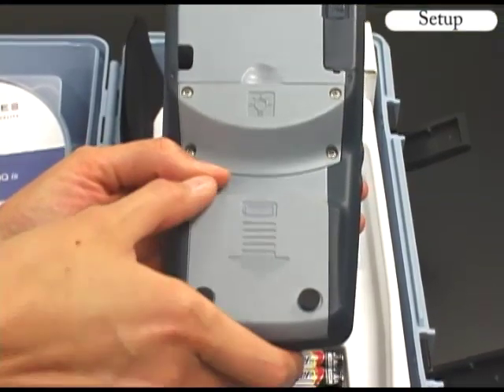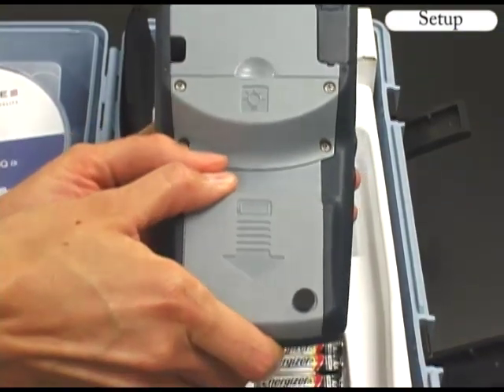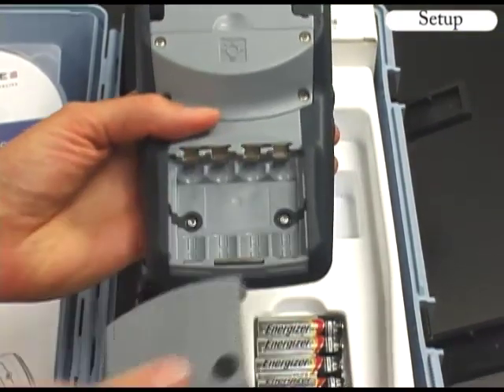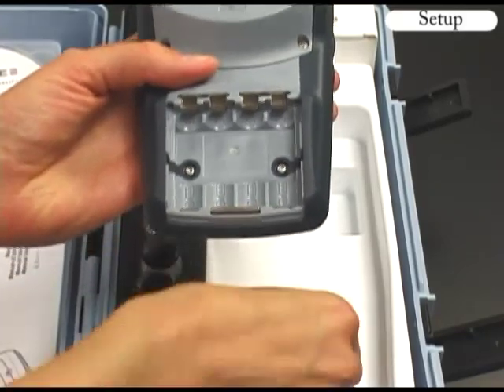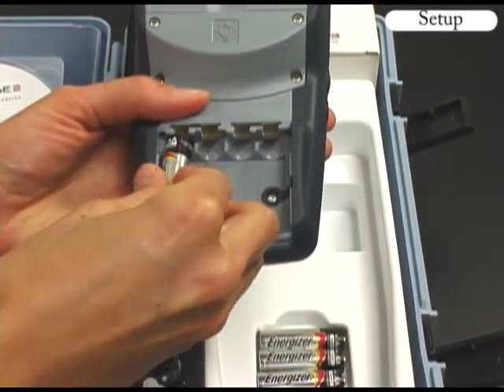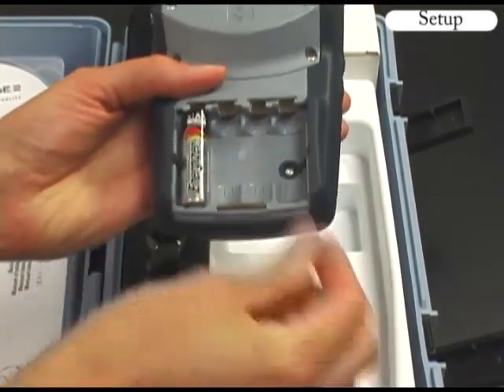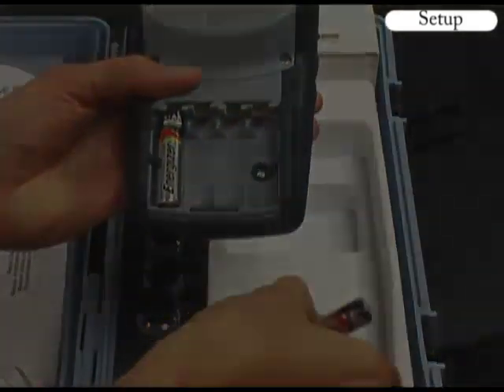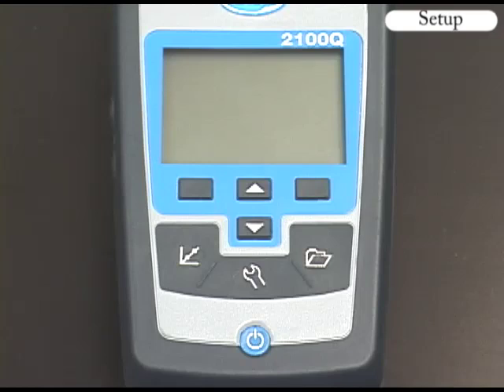Slide the battery cover off in the direction of the arrow and install the batteries as shown. I will now describe the keypad functions.